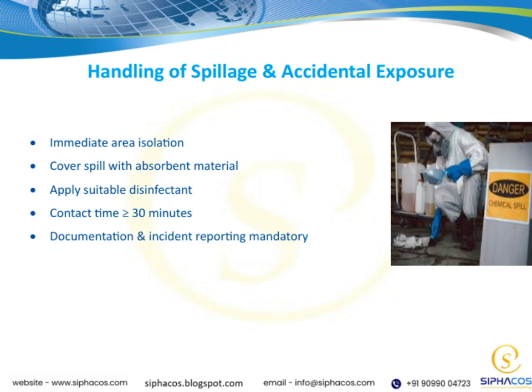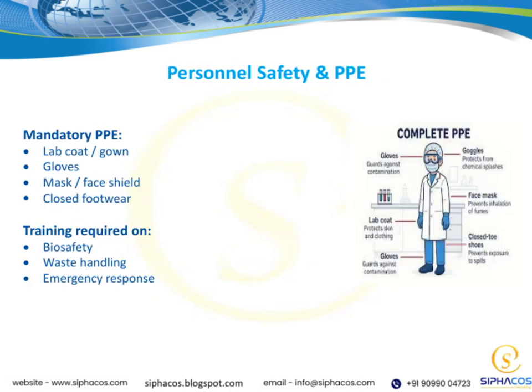Handling spills carefully and methodically is all about minimizing risk and ensuring safety at every step. Let's talk about personnel safety and PPE, which are absolutely essential in our lab environment. First, when it comes to mandatory PPE, there are a few key items you must always wear.